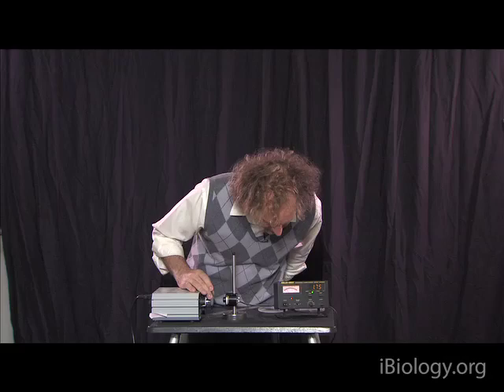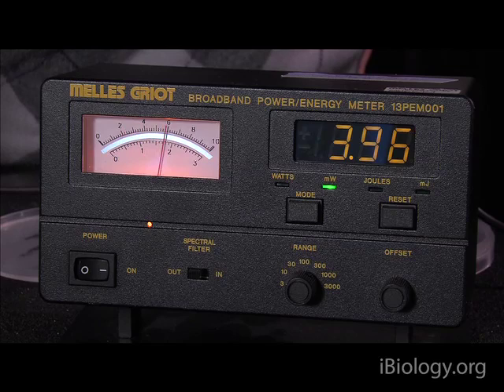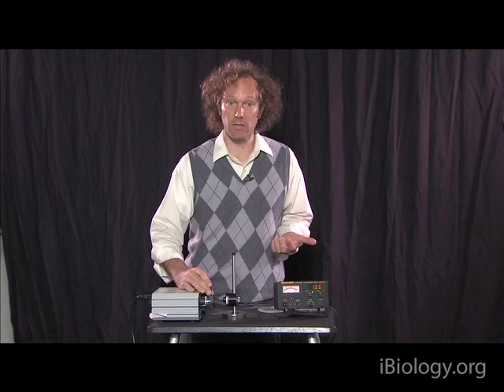So now it's in, and it's out, and it's in. I don't know if you can see, but the dial doesn't go all the way to zero. It seems like there is still some intensity entering into the detector. Well, maybe that's just room lights.